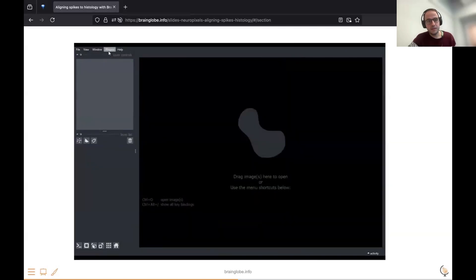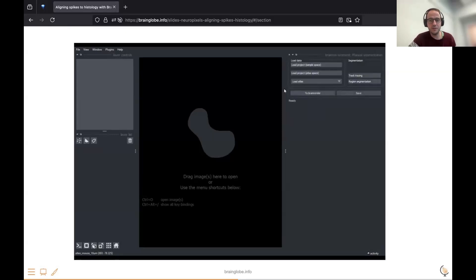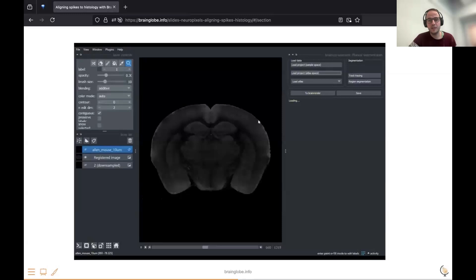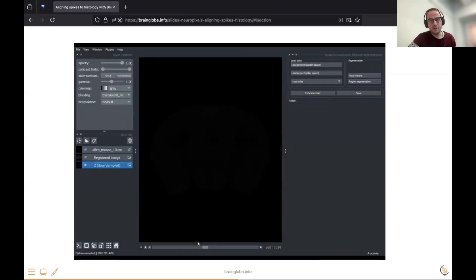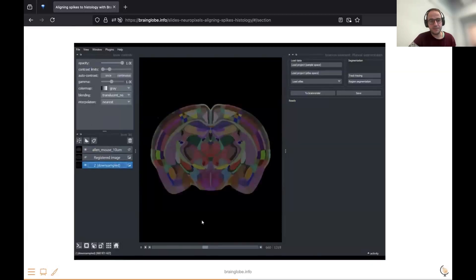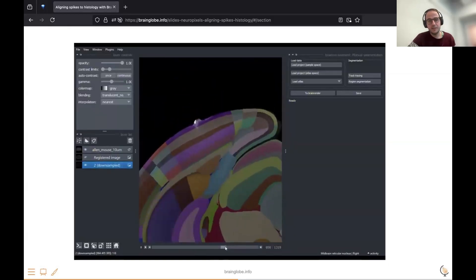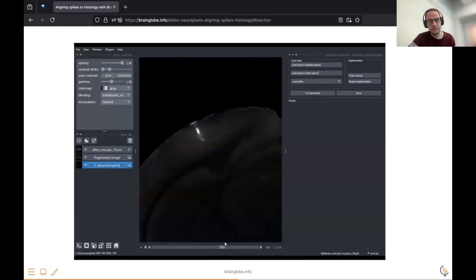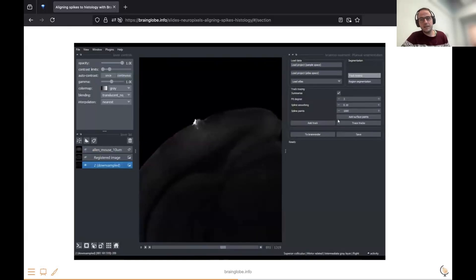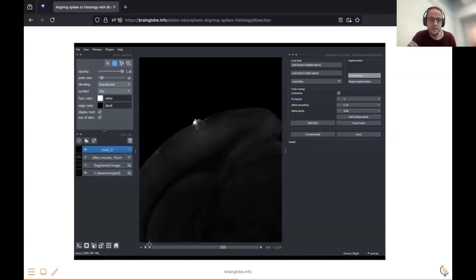Then we have a different tool called BrainGlobe Segmentation. You can load your results from the previous tools, either in the coordinate space defined by your sample or in the coordinate space defined by the atlas — which is more powerful because it allows you to overlay data from several samples. Here we've loaded it in sample space, and you can find the bright, fluorescently labeled probe in your data. Using the track tracing button, you can segment it out manually.